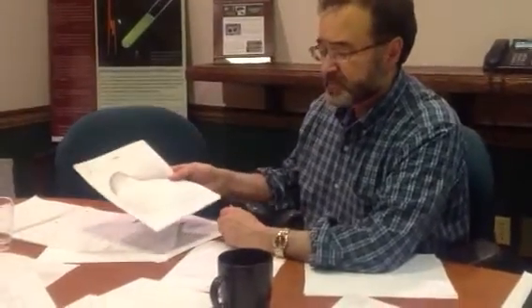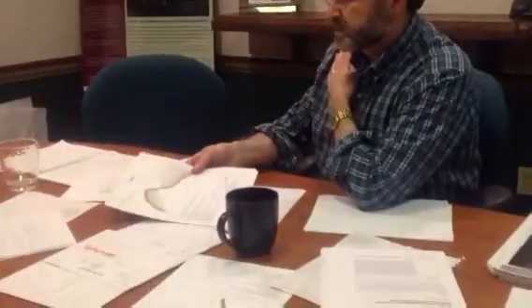Fantastic. And then on this visit, we tried a different application. We have an interest in studying how vitamin A degrades, and the protein that we're studying is a high molecular weight lipoprotein in the extracellular matrix around the rods and cones. We think that this protein protects vitamin A from photodegradation, and we have a paper published in 2014 in Experimental Eye Research that shows the protein has this function.